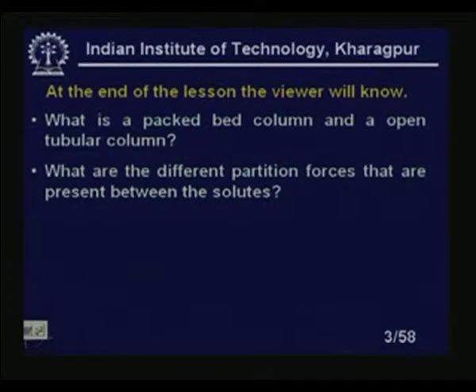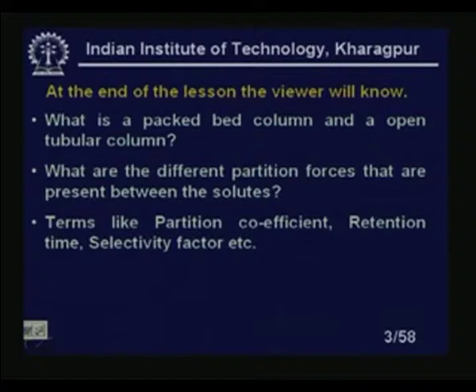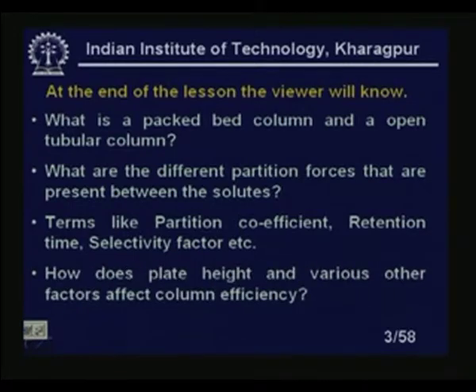We need the column, the tubular column or packed bed column, through which the mixture will be passed. So, we will discuss what a packed bed column and an open tubular column are. Then we have the different partition forces that are present between the solutes. Terms like partition coefficient, retention time, and selectivity factors, we will learn in this lesson.